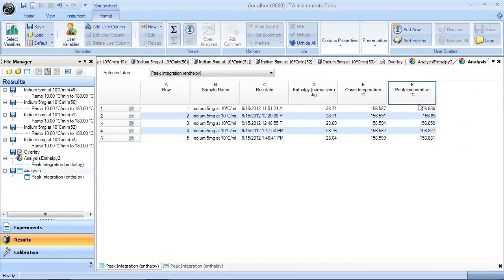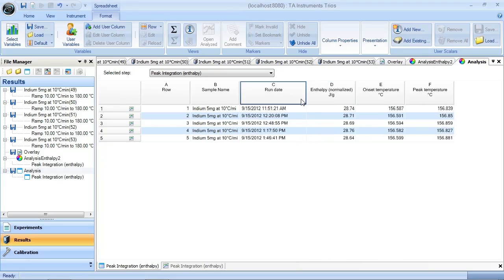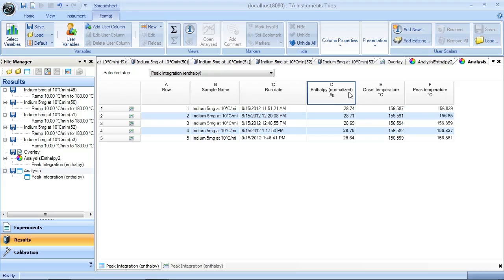So the way that this looks can be customized by the user. More importantly, this data itself can be graphed. So I can take now and I can plot sample number versus enthalpy, for instance. And that's what this graph is here.